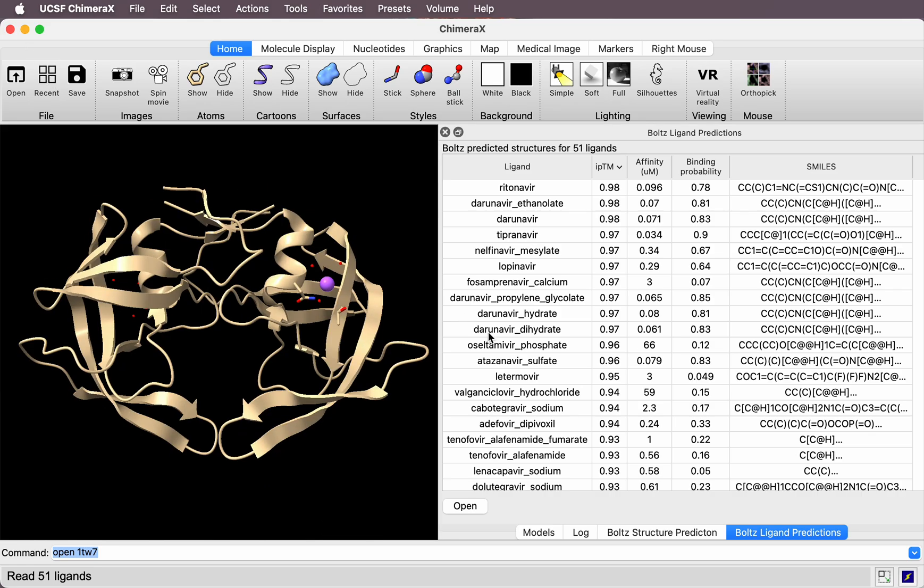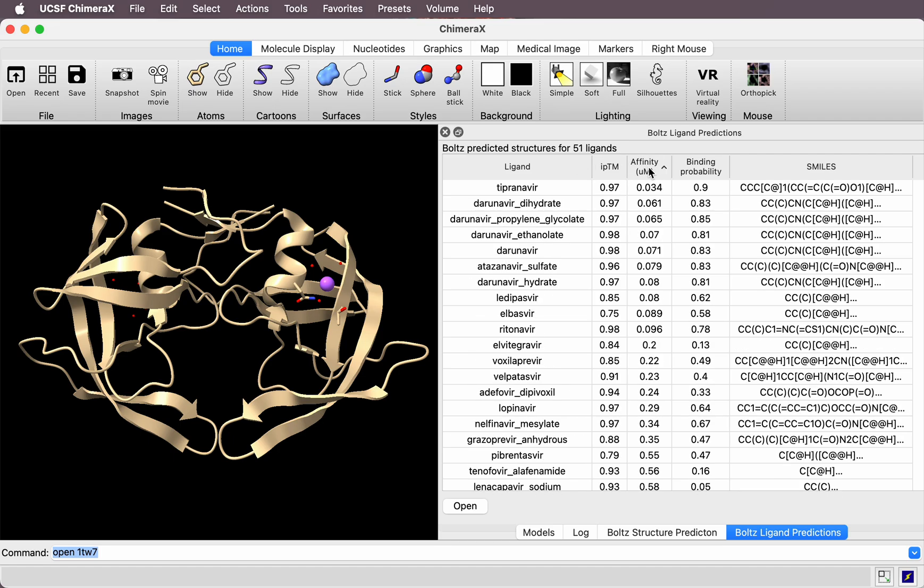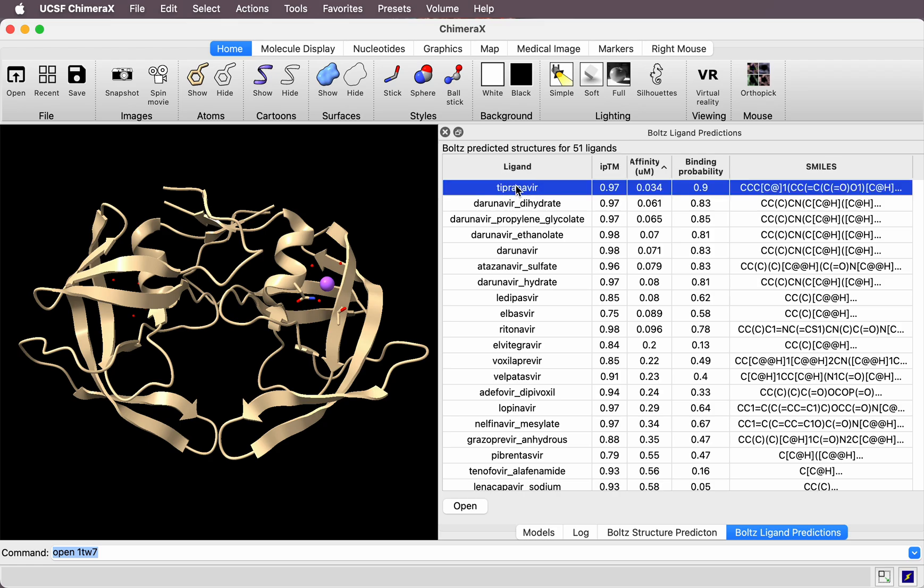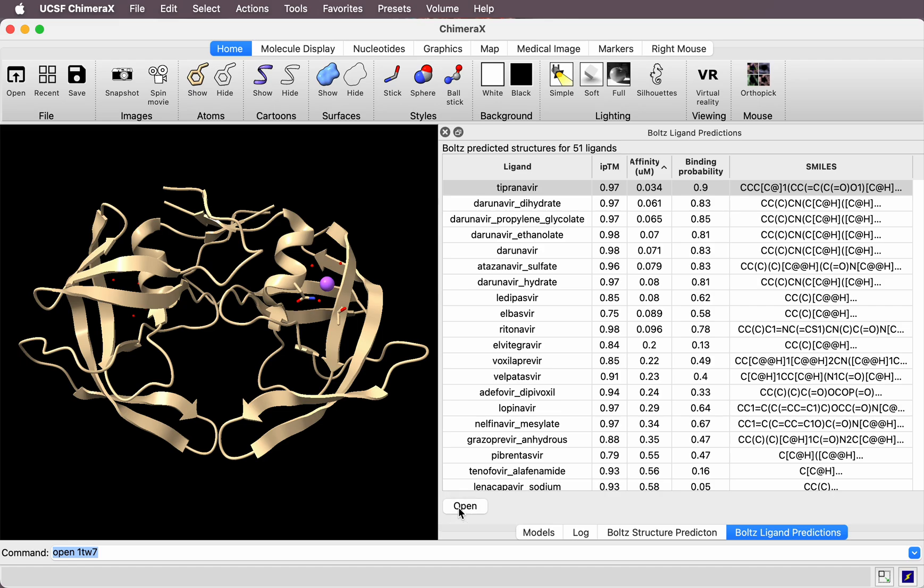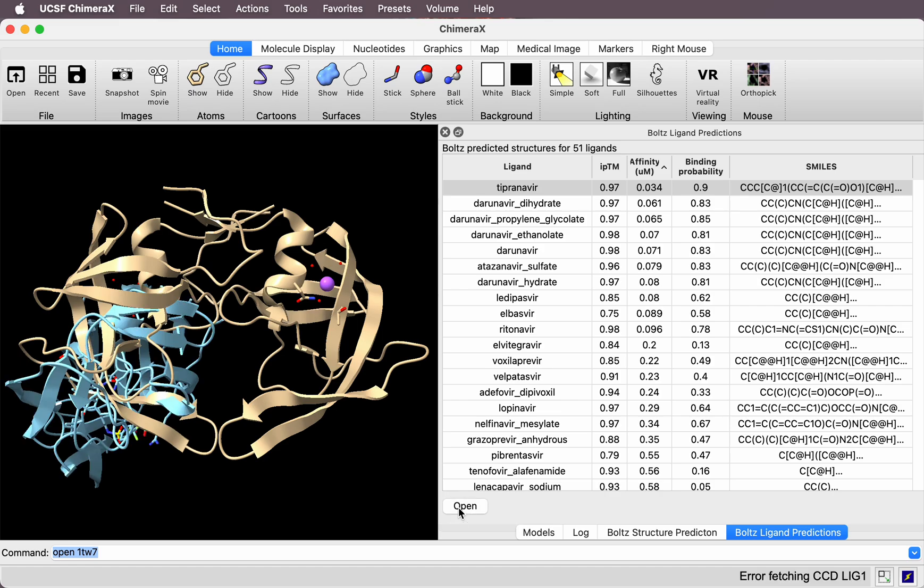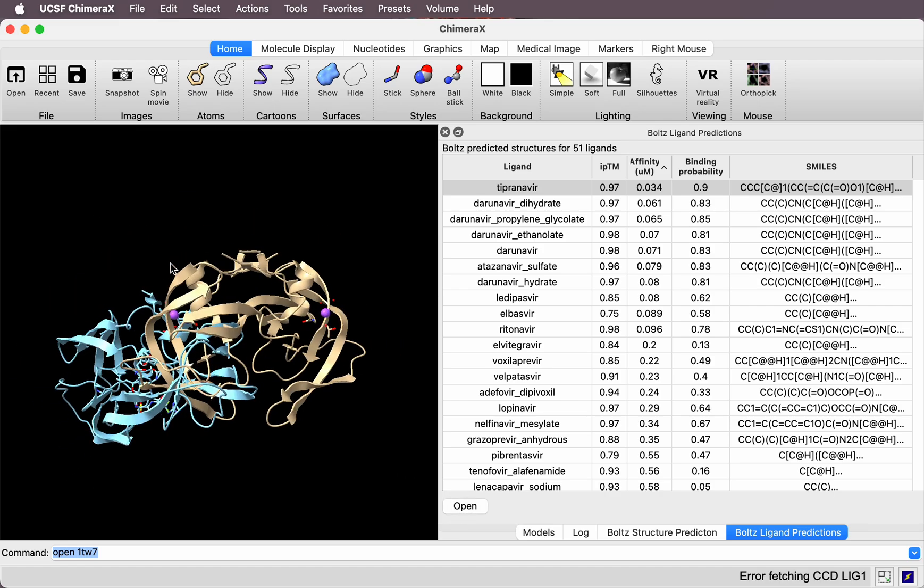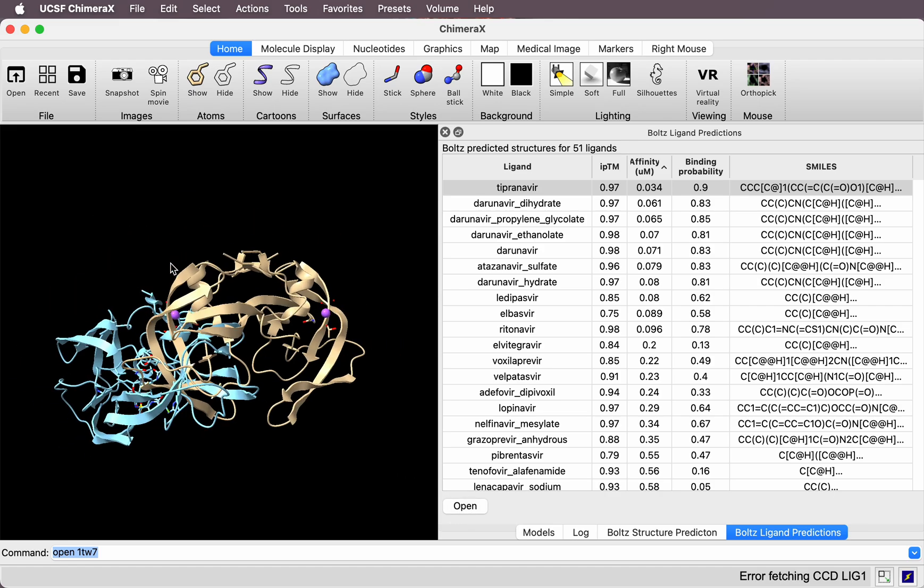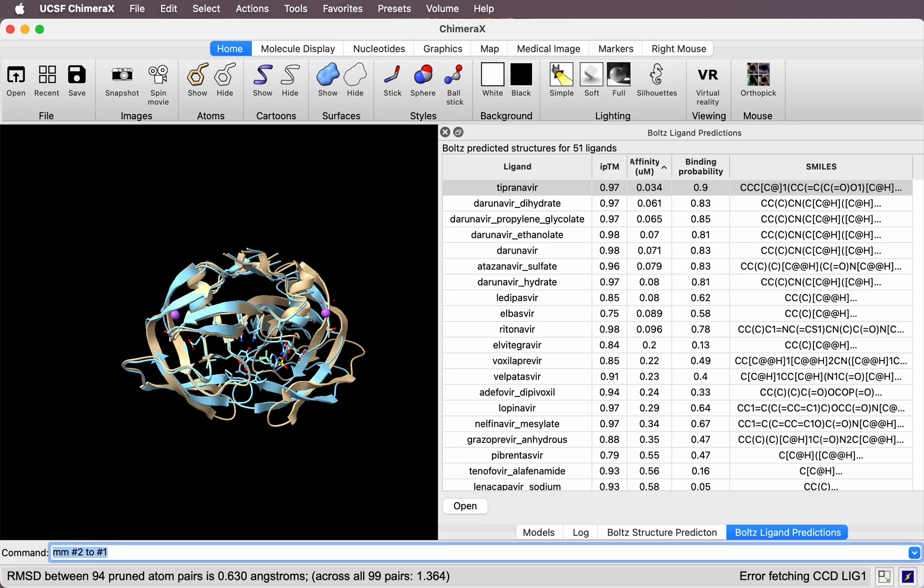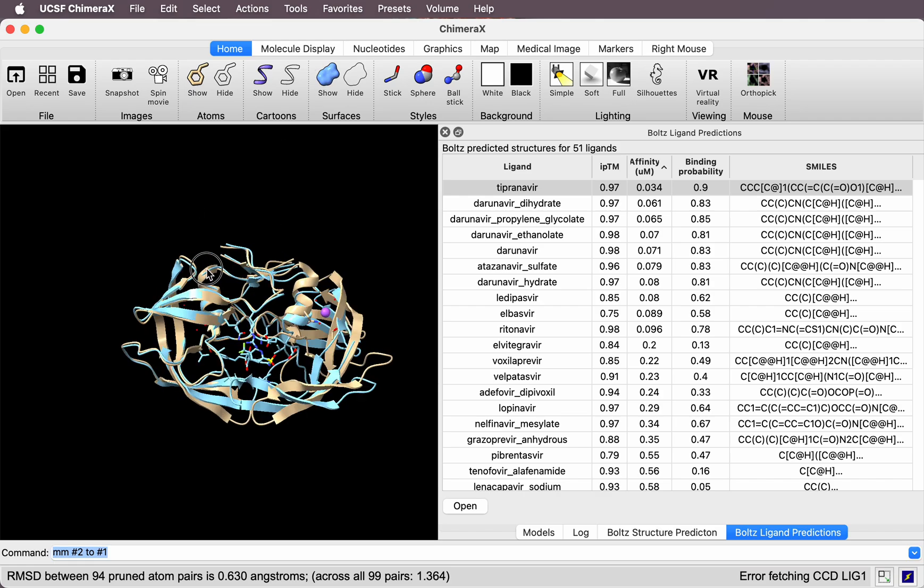You see they have a confidence score, affinity score, and binding probability in the table. You can sort by affinity by clicking on the affinity column. You can open one or more structures by selecting them and clicking the open button. Here it didn't align to the original structure—I can align it with the matchmaker command.